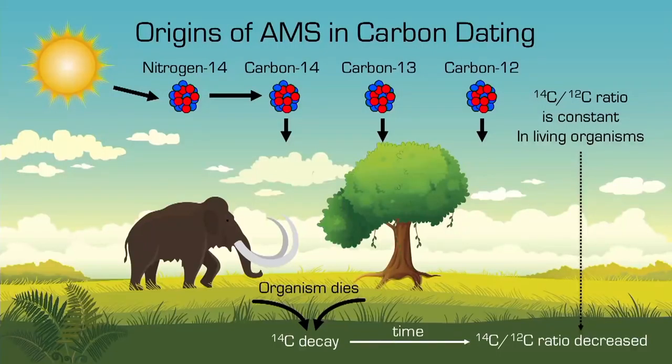And then about 25, 30 years ago, physicists and biologists at the lab got together and thought of some ways that we can apply this AMS technology to biology, and how we can trace these chemicals through biological systems at very low levels.